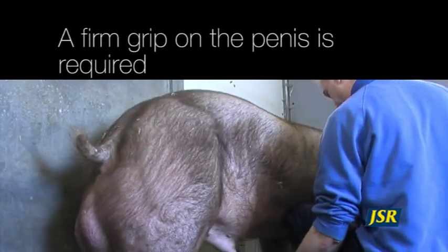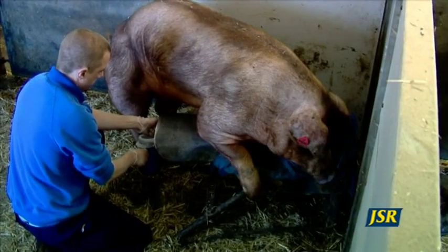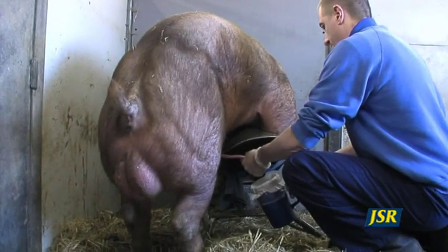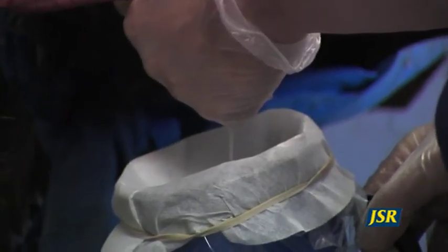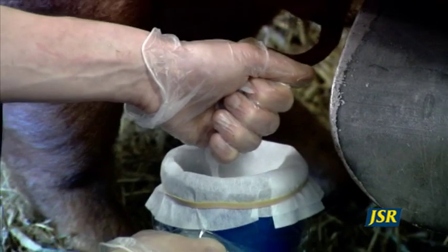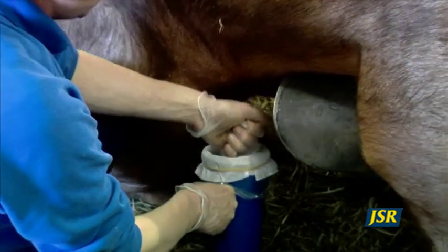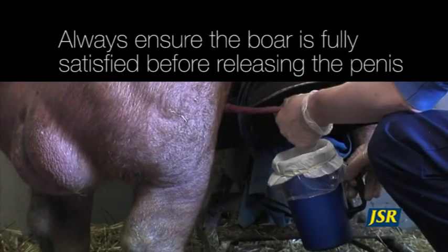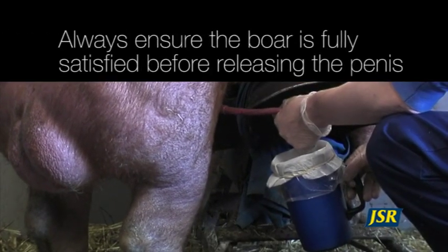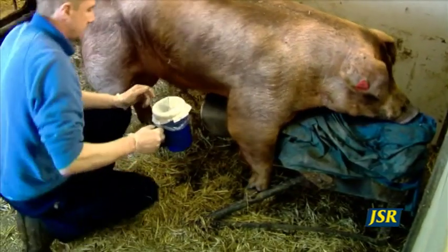As soon as the boar has mounted, do not release your grip on his penis. This will cause him to dismount the dummy. Sometimes you need to hold on for several minutes. It is necessary to repeat the training two or three times to ensure the young boar is familiar with the procedure.